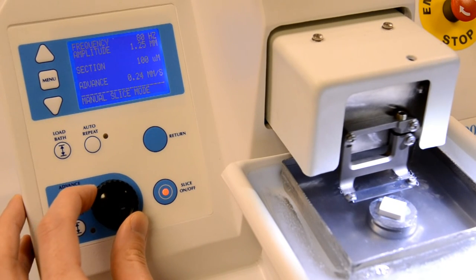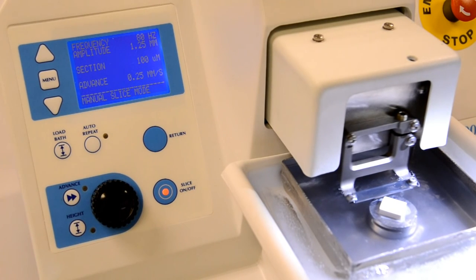Press the slice on-off key and the cutting head will start vibrating. Use the rotary knob to control the advance speed of the head through the slice.